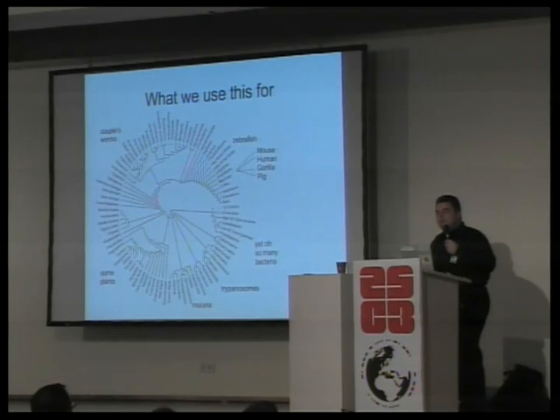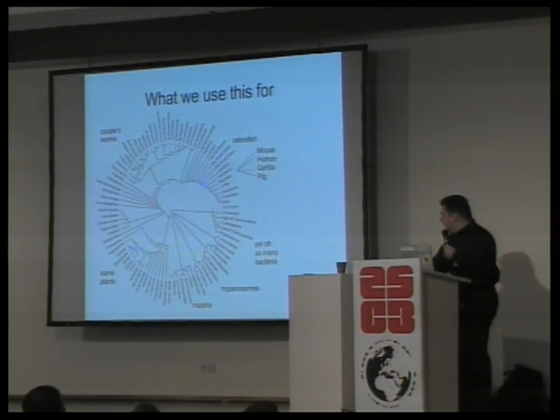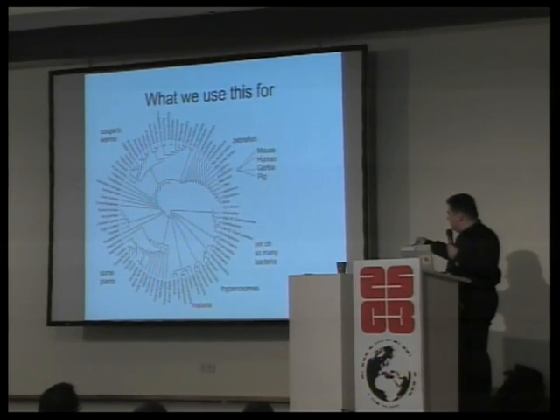Our best guess is they accidentally took something from the mosquito gut, because we partially assembled some of the mosquito gut bacteria, found some fun viruses, and I found about 1% Yersinia pestis, which causes Black Death, so I'm quite glad I'm not in sample preparation. We have some trypanosomes, and malaria in red, because this is what I am actually working on.